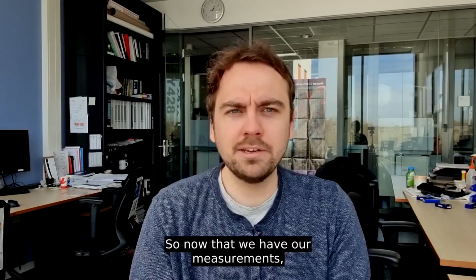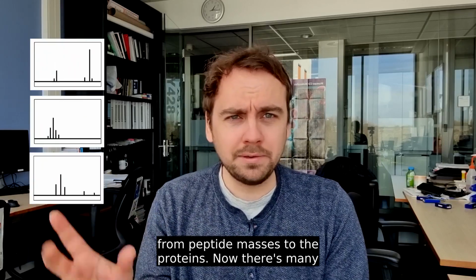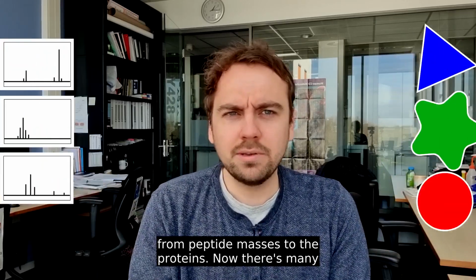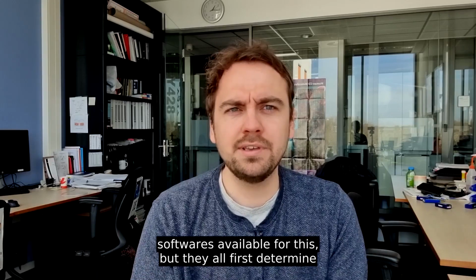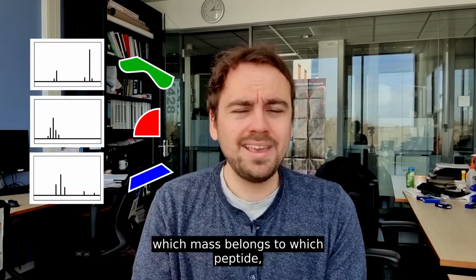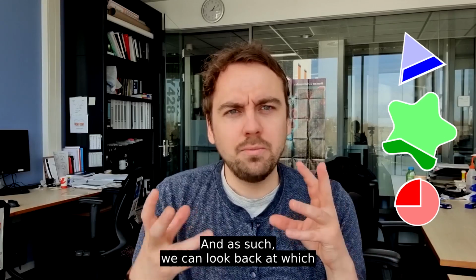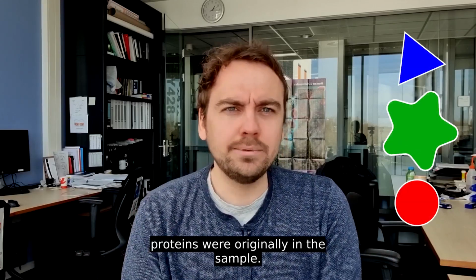So now that we have our measurements, we get to the data analysis. And the first step is to get from peptide masses to the proteins. Now there's many softwares available for this, but they all first determine which mass belongs to which peptide, and then it looks at which proteins do these peptides come from. And as such, we can look back at which proteins were originally in the sample.